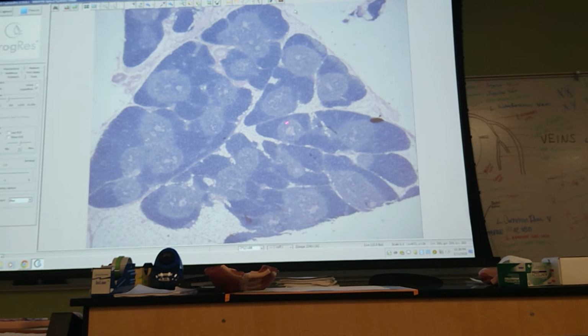All these white divisions are trabeculae. They're much more obvious, but they're the same basic idea. Trabeculae, or little beams, provide a scaffolding. It's similar to the pillars we have in this room. Pillars are the scaffolding for a building, right? They hold the thing up. Exactly the same idea.